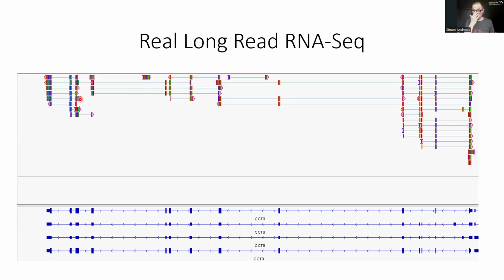And this is the problem that we're trying to address today with nexons, is finding ways to quantitate and evaluate the quality of these sorts of long-read mapped data sets. Now, one of the biggest problems with this type of data is the complexity of the transcriptome. And we are going to use the annotated transcriptome from a genome assembly to guide the annotations and the counts that we're going to generate.